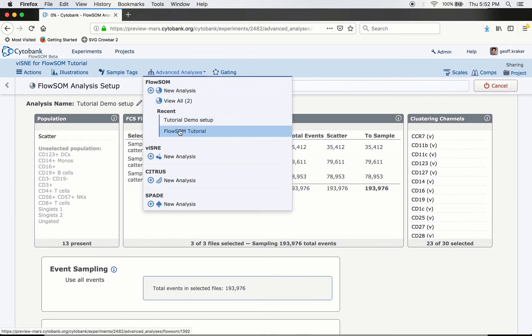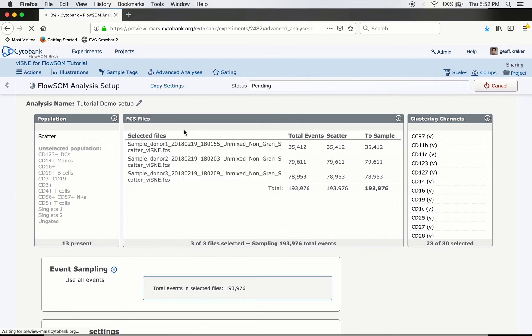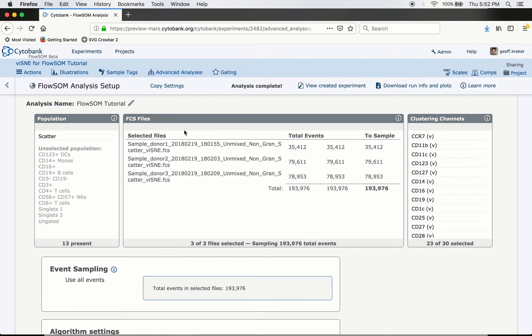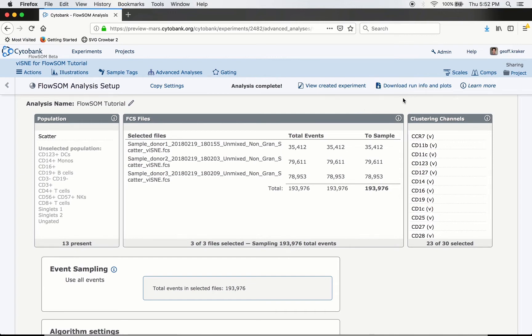There are two components to a completed FlowSOM analysis. One is the run information and plots. The other is the created experiment, which has all the original FCS files with the same gates and scales, plus two added channels in each FCS file: one for which cluster an event belongs to, and one for which meta-cluster the event belongs to.